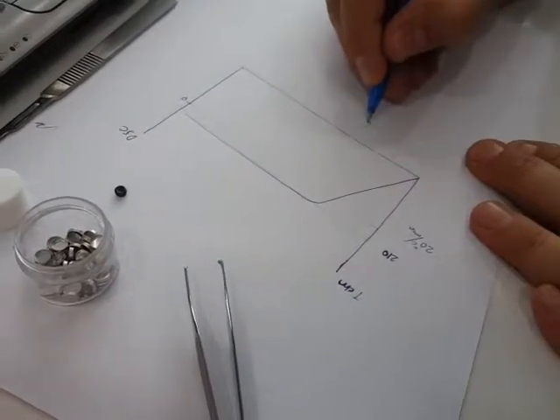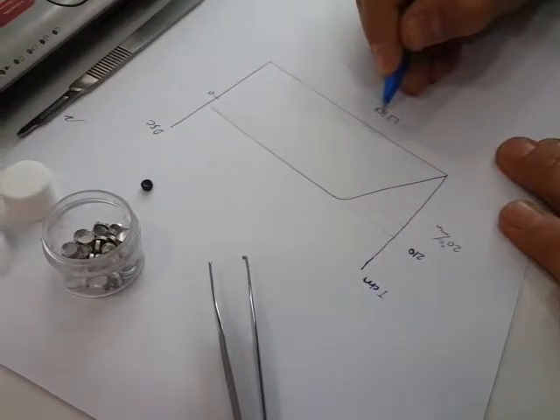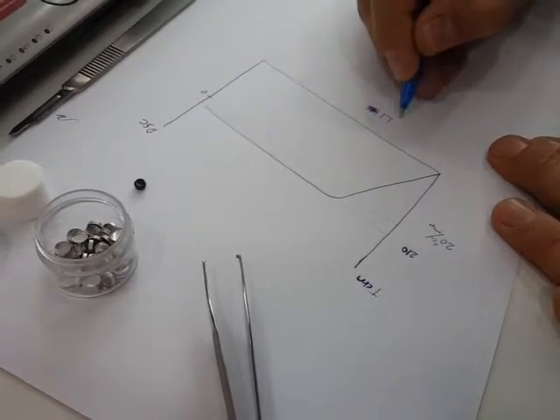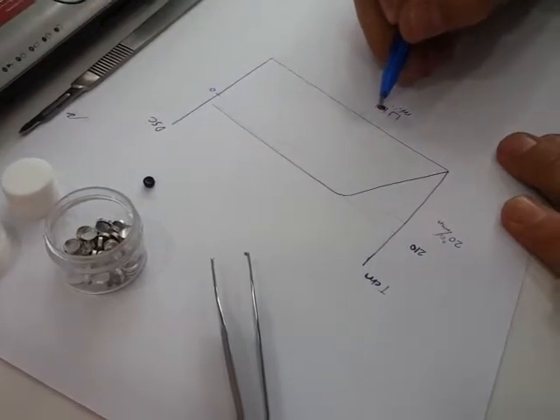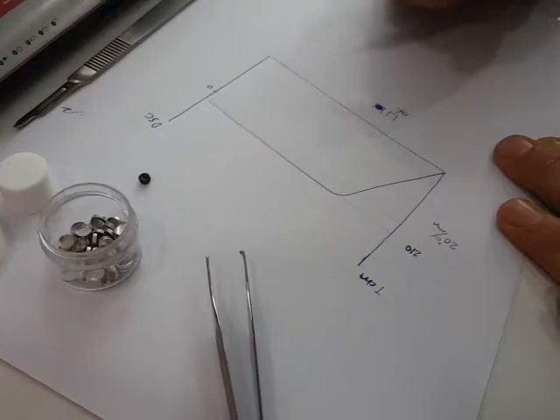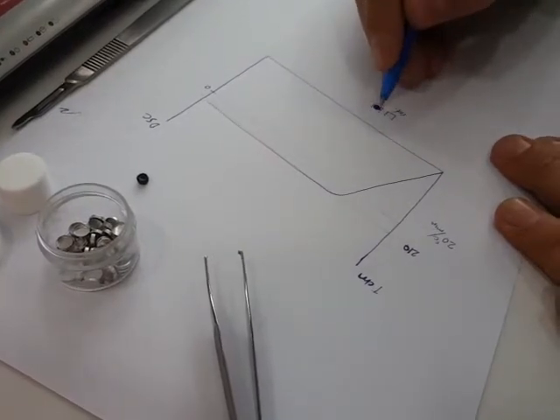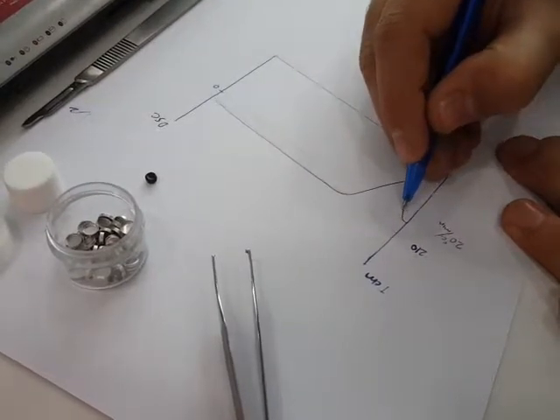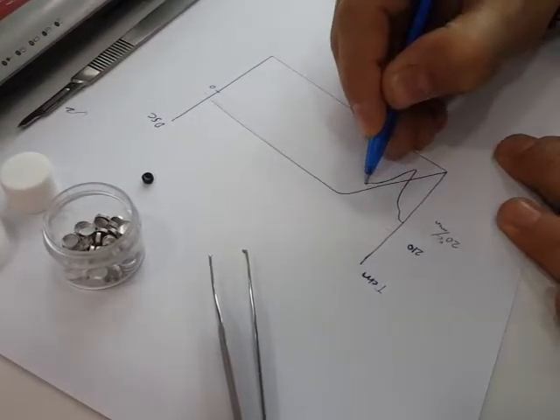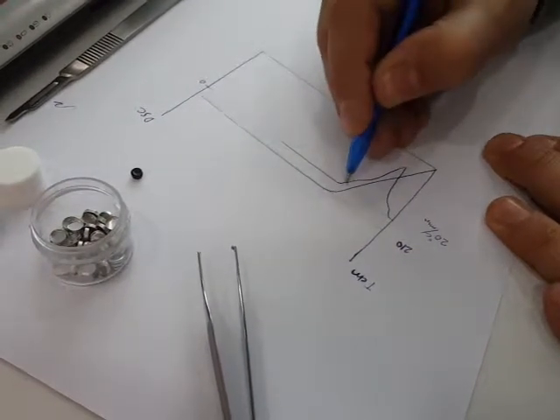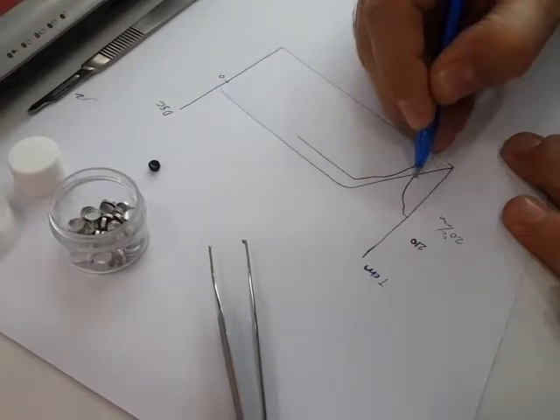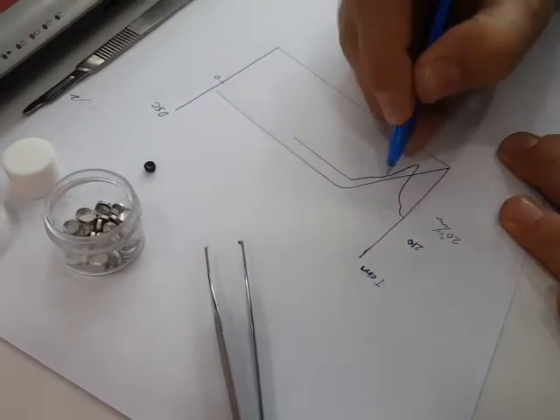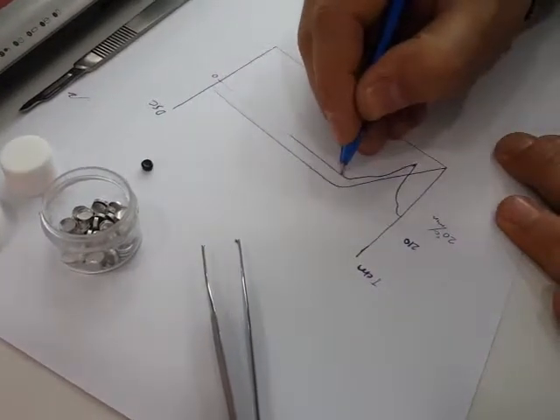You have two sensors, one is for sample, the other is empty as reference. When the material is melting it consumes energy to be melted and absorbs temperature from surrounding area. The DSC line will be something like this for polyethylene. During temperature rise it will go down and then come up. After melting is done it will rise again to be stabilized in a horizontal line near to zero DSC.